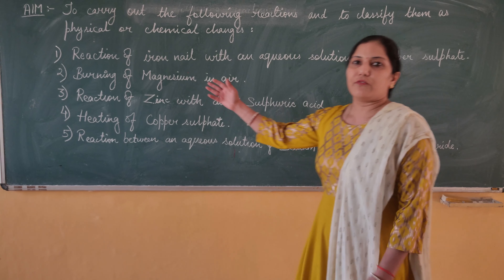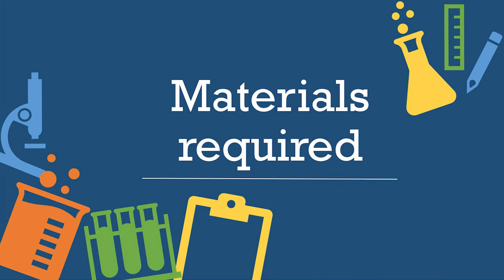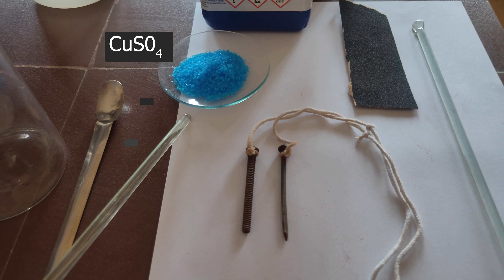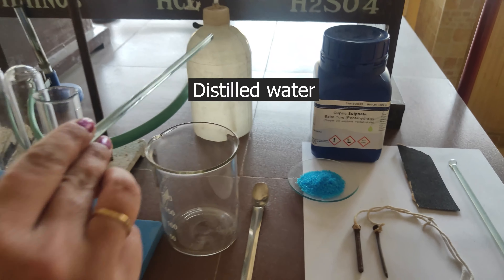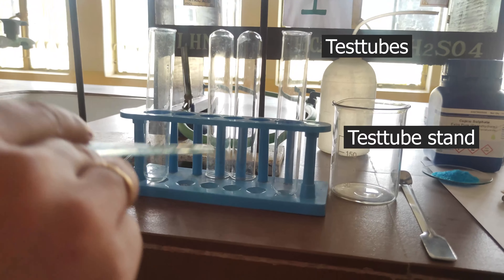So let's begin with our first experiment — reaction of iron nail with copper sulphate. Materials required: copper sulphate, two iron nails, thread, sandpaper, glass rod, distilled water, spatula, a clean beaker, test tubes, test tube stand, and two clamp stands.